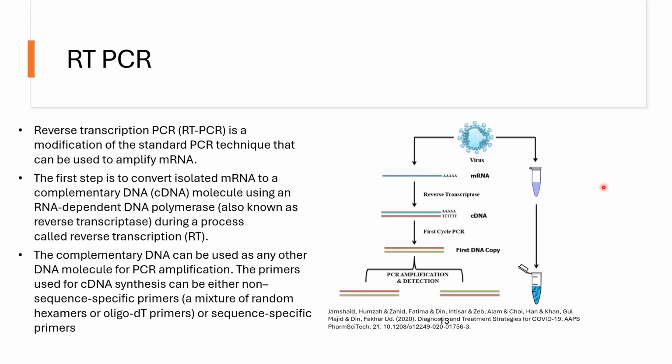Amplification of a housekeeping gene must accompany each reverse transcriptase PCR reaction as an internal control to monitor the quality and quantity of RNA in a given sample. Endpoint PCR is a method for nucleic acid amplification where the maximum number of copies of DNA or RNA target is produced. This type of PCR offers qualitative answers on whether or not a particular target sequence is present, but not quantitative information. RT-PCR is also a form of endpoint PCR like the conventional PCR.